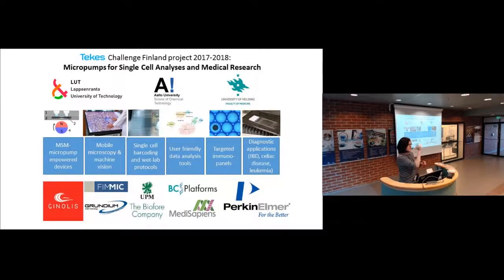But if there's just random mismatches somewhere there, then it must be sequencing error. So if we cover it, for example, with Nanopore, we have to sequence it very deeply, the same sequence again and again and again, and then we can see from the data that there are some sporadic errors here and there, so that they must come from the sequencer, and we can correct that to the consensus.